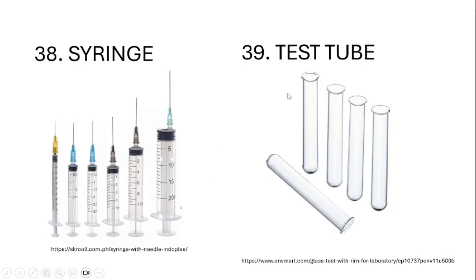By the way, for safety purposes, remember that when syringes are not in use, you must always put the cap, its plastic cap. And upon disposal, we are going to put this in its designated garbage bin. There's a label on the trash can in the laboratory.